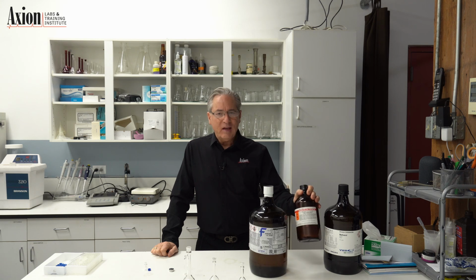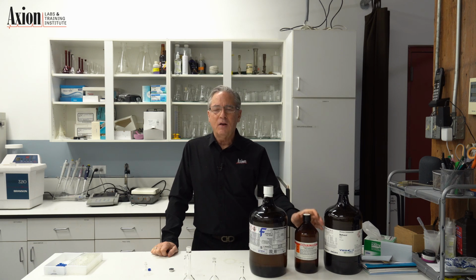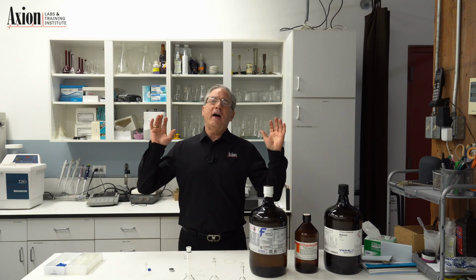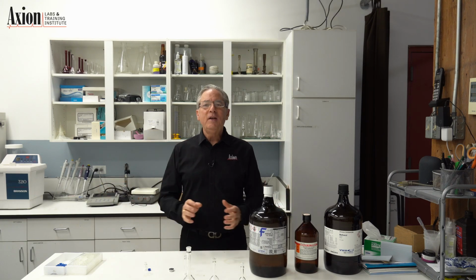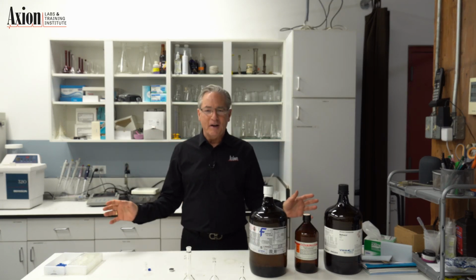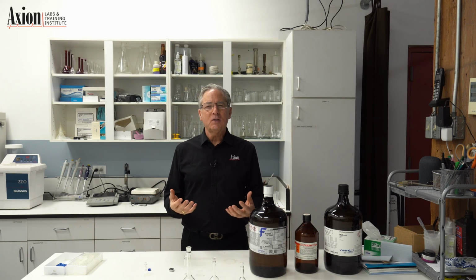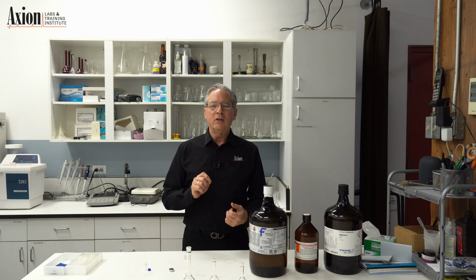In between we have something like ethyl acetate. Keep in mind there are hundreds of different solvents because we're talking about GC. This is applied to 1 million different samples, which means there are 2 million different sample prep approaches. But the simple concept is you need to get your sample, dilute it in a solvent, everything is volatile, and then we're going to inject 1 microliter of that onto the GC.